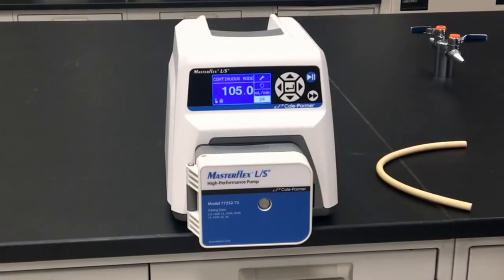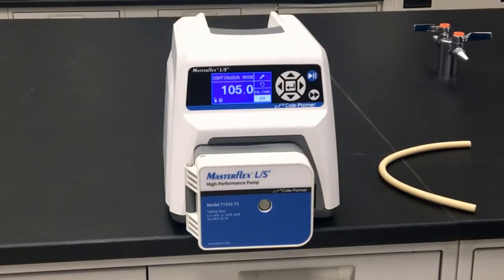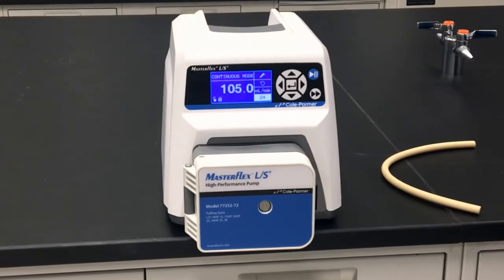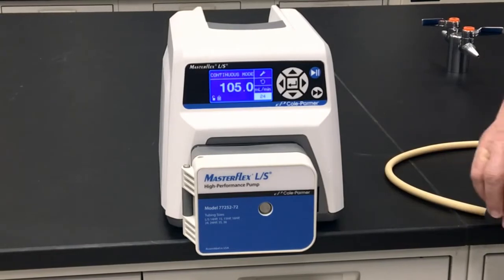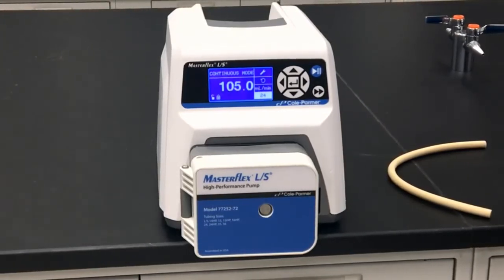The MasterFlex LS high-performance pump head delivers flow rates up to 3.4 liters per minute, pressures up to 150 psi, and an ergonomic design that makes tube loading virtually foolproof. Proper tube loading will ensure optimal repeatable performance while maximizing tubing life, and is quick and easy with just a few simple steps.